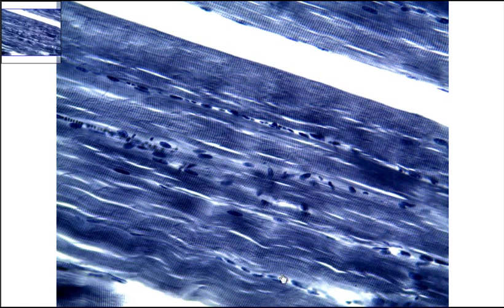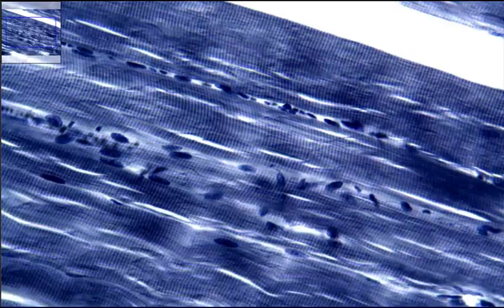Hopefully you're also noticing a lot of these little black dots. And a third thing, these little lines going across the muscles. So if we zoom in, you'll get a little more detail of what's going on here.